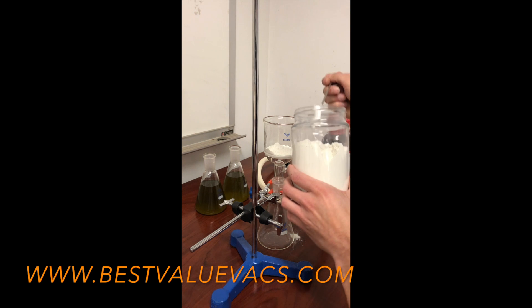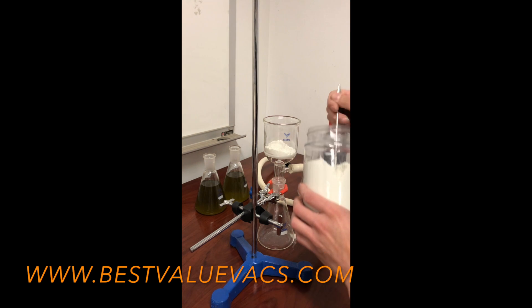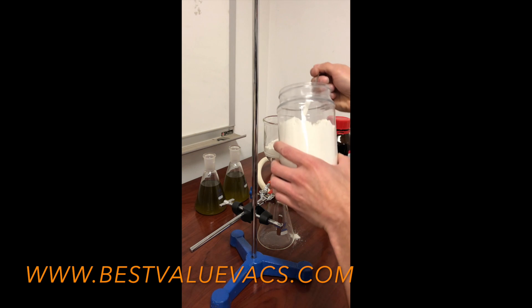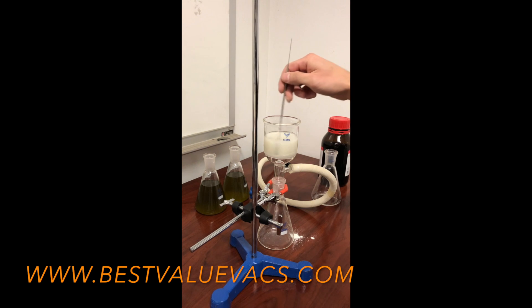What I'm doing right now is adding enough Cellite 545 to create about a quarter-inch thick pad by scooping it in there. Then I'm going to add some water and fill it up about three quarters of the way. I'm using reverse osmosis water so it's totally pure. Then I'll stir it up.